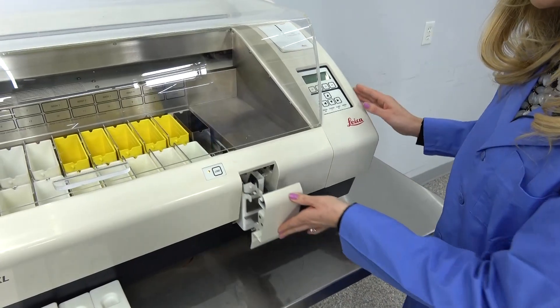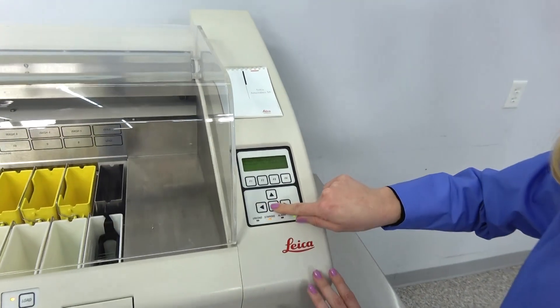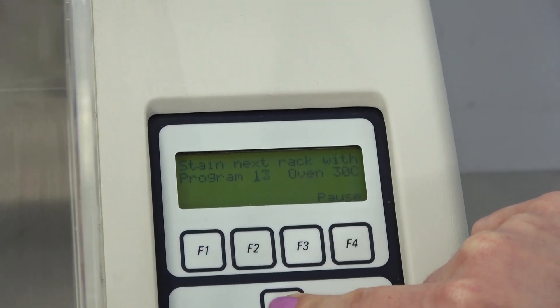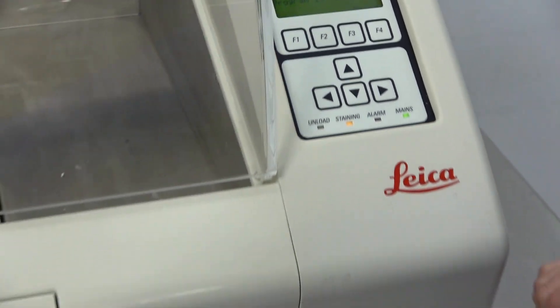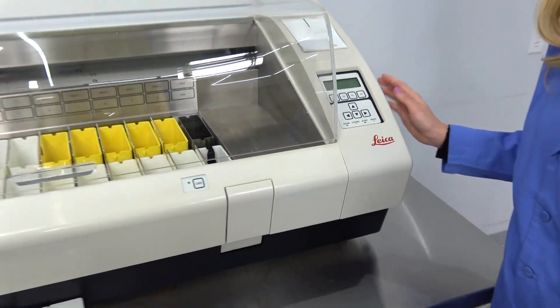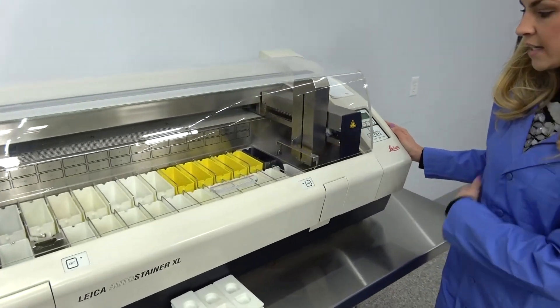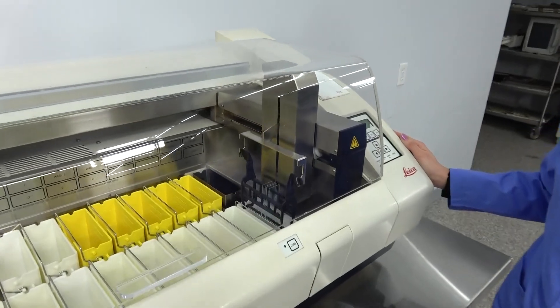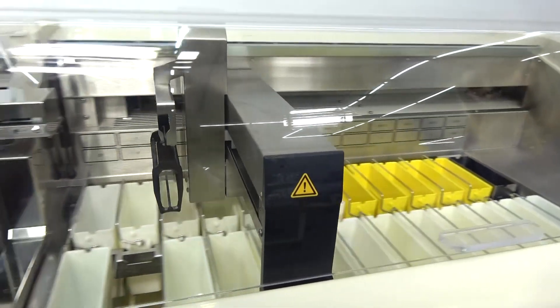Here on the display you can easily toggle through all of your programs. Currently we are going to pick program 15 and we're going to hit load. The robotic arm is going to come back to the initial position, pick up the basket, and it's going to transport to any program that you have in.